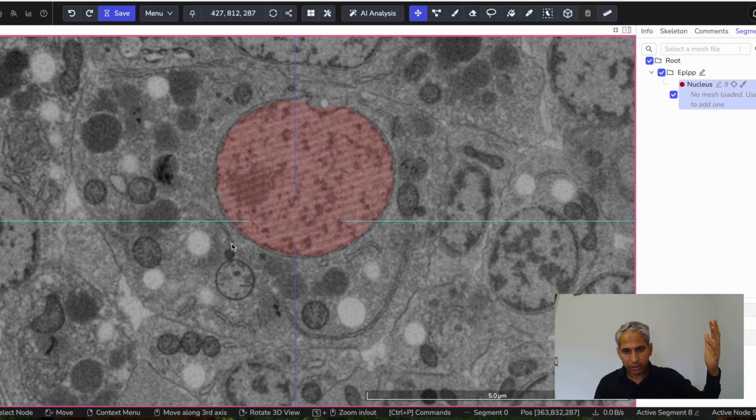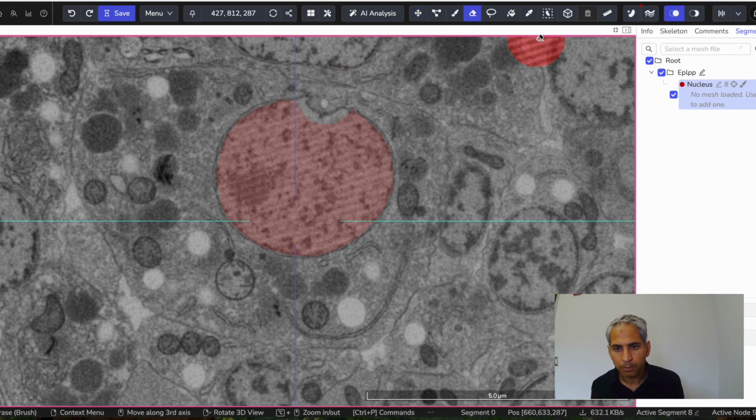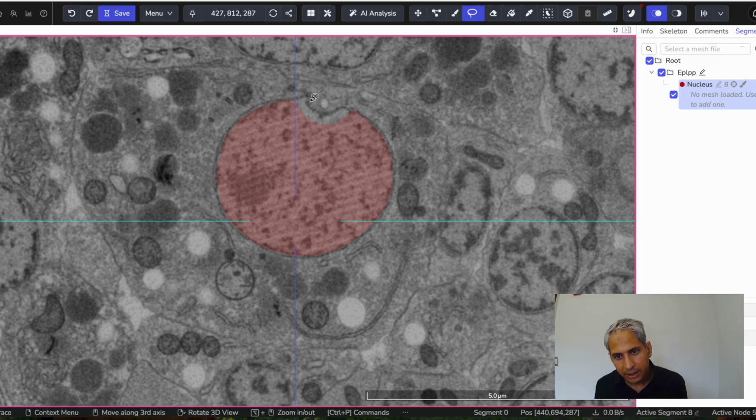Look how round everything else is, but here there's this issue. I'll even go a little bit deeper, and I'm going to erase part of the nucleus to make it clear. Look how the nuclear membrane seems to be indented here. Let me fill that in again. There you go. That's not what I intended. Let me undo that. And then when I trace, let me close that trace so that it highlights everything in between. You can be careless at this stage because it's already highlighted.